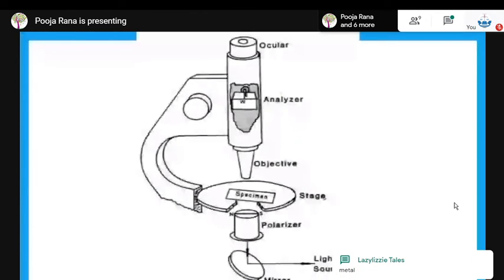We will not be subjecting hair to examination under polarized light microscopy, all right? Because in polarized light microscopy, which you will later see in a video also, what you see is the structure of that particular sample. In hair, we know that by looking at the texture of the hair, when we subject it to a normal stereo microscope itself, you can get to know the structure of that hair sample, whether it belongs to an animal or it is a human hair. All right. Yeah, hair is observed under a stereo microscope. The structure can easily be examined in the stereo microscope.